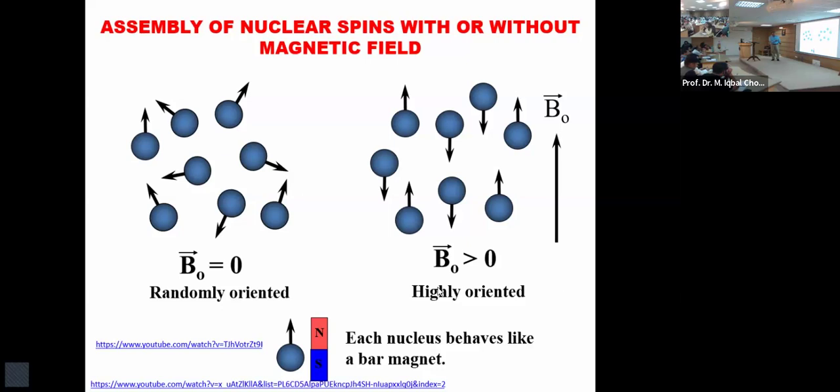And these magnets have to survive. When they are placed under the magnetic field, they divide themselves into two quantized states, at least two quantized states. There are elements which divide themselves into 7, 8, 9, 10 quantized states. We'll discuss this later. But dipolar nuclei would divide themselves, millions of them, trillions of them.